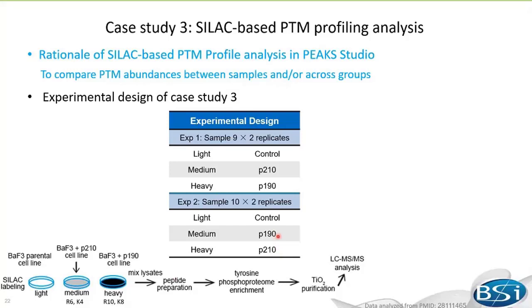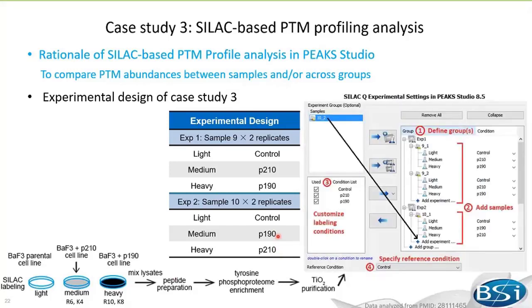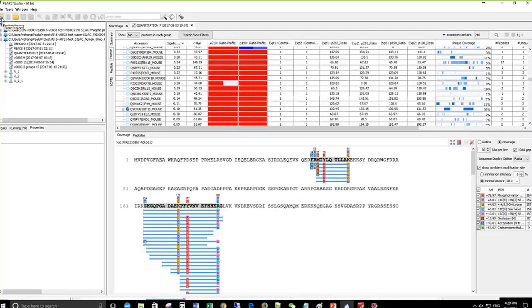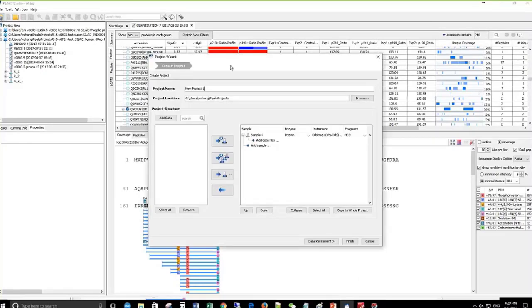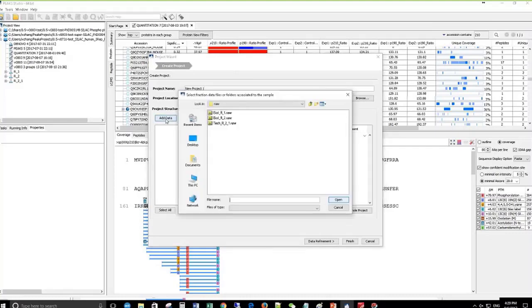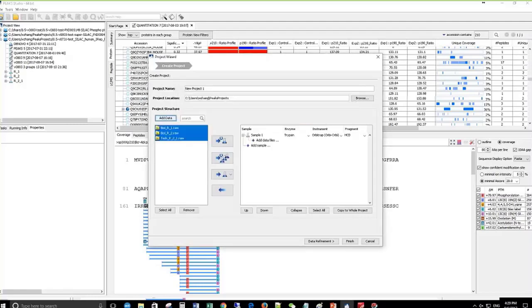Here is how PICS Q is set up accordingly. Three conditions are specified: control, P210, and P190, each group including two repeats. In experiment two, the medium channel is for P190 and the heavy channel is for P210. By clicking the New Project button, you can start uploading your data and begin the analysis. For this demo, I will use three technical replicates for a one-group analysis case study.